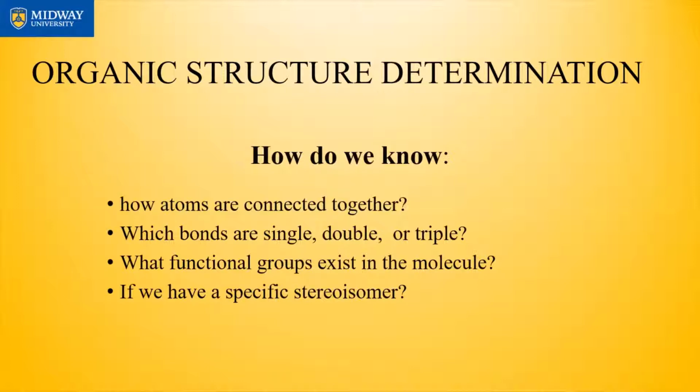Right now, with infrared, I don't think stereoisomers can be much of help, but we can definitely look at functional groups as a tool. Now, with mass spec, we could not tell which functional group is present unless I give you a bunch of structures and then give fragment patterns. Then you can go ahead and identify.